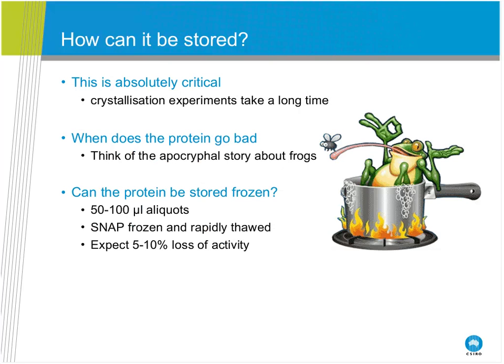You set up an experiment and it might take days or weeks or months, some people years, I'm not that patient, for your experiment to actually produce results. And if you want to then follow up on the results from your initial screening, and the initial screening takes months, how are you storing your sample while that process is going on?